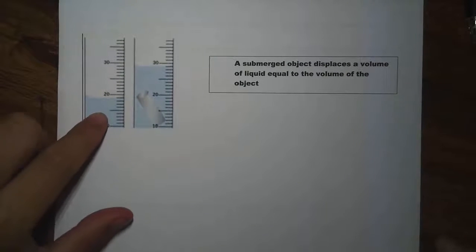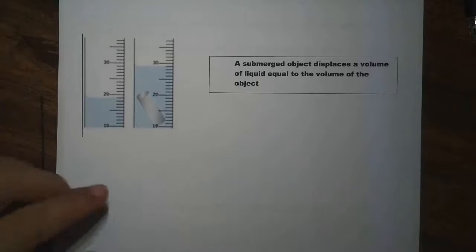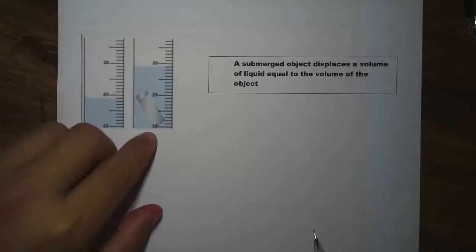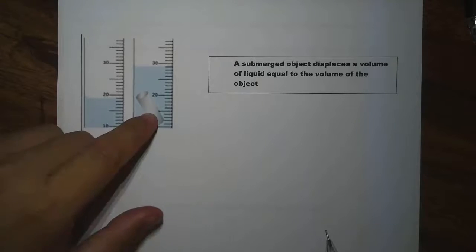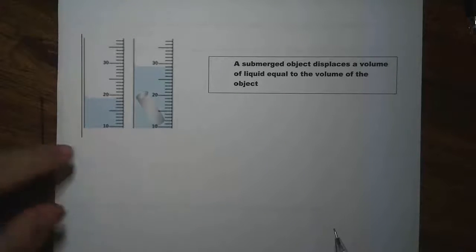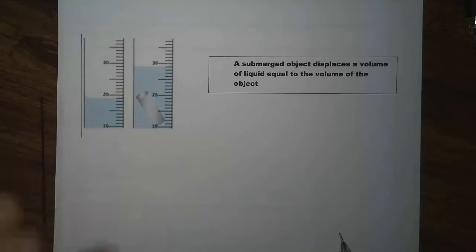So let's go back and look at this picture right here. First of all, we have water, and the water will be in a graduated cylinder or any container. What we have here is an object or a substance. We want to measure the volume of this object very quickly, and one way we can do it is using the water displacement method.